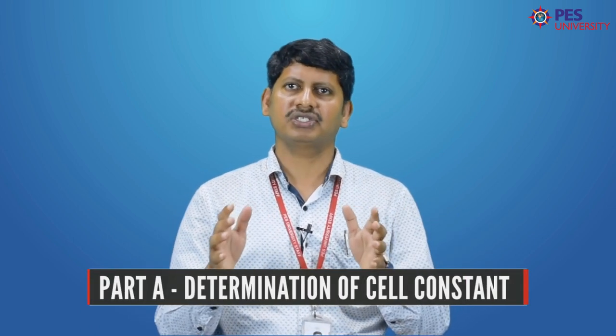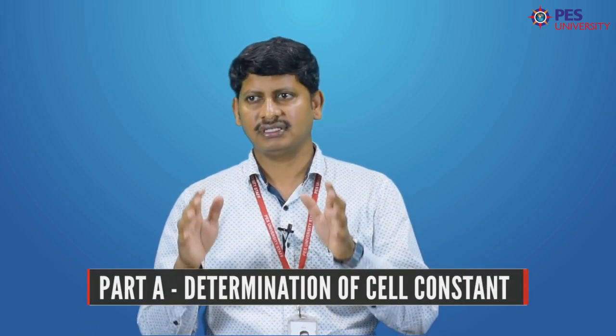As you know, there are 2 parts in this particular experiment. Part A is nothing but determination of cell constant of a given conductivity cell. Actually, the cell constant value is already there on the conductivity cell, you can check it. However, we have prepared 2 differently concentrated solutions, that is 0.1 molar KCl and 0.01 molar KCl solutions. And also we measured observed conductance for 0.1 molar and 0.01 molar KCl solution.